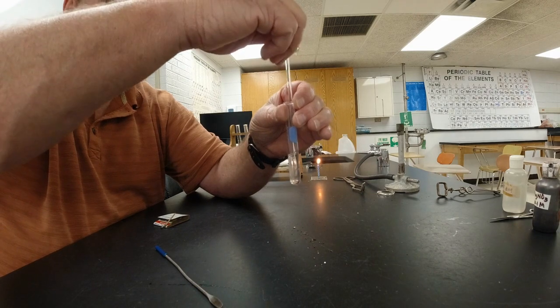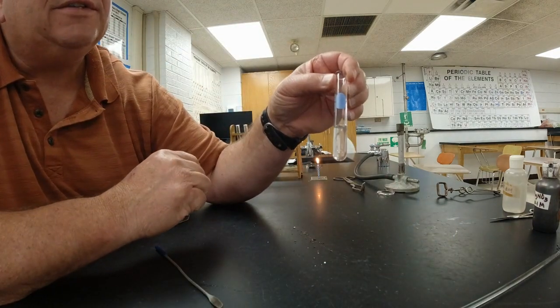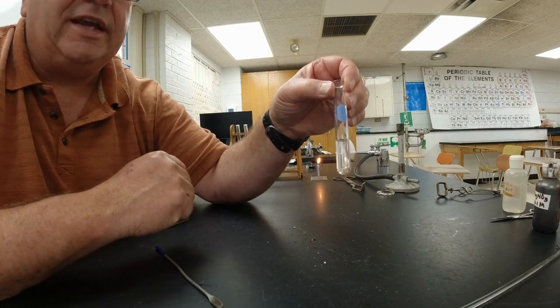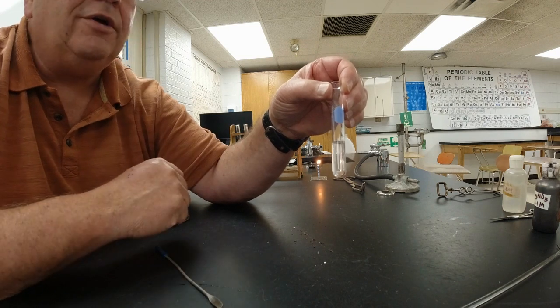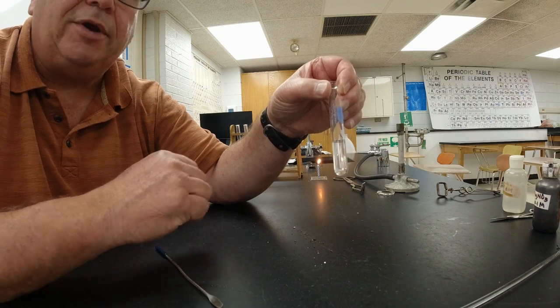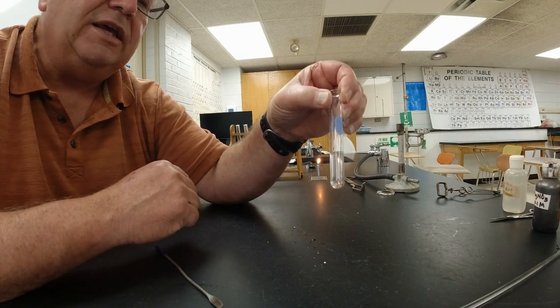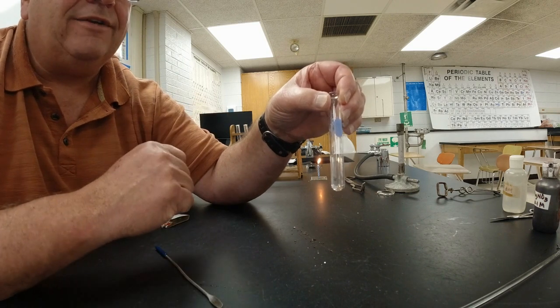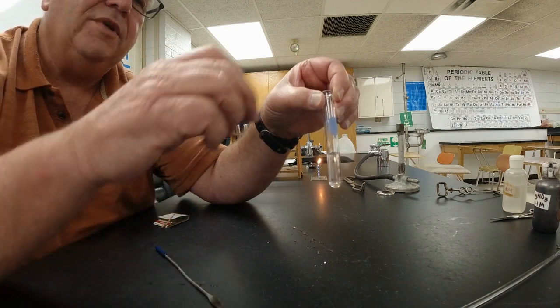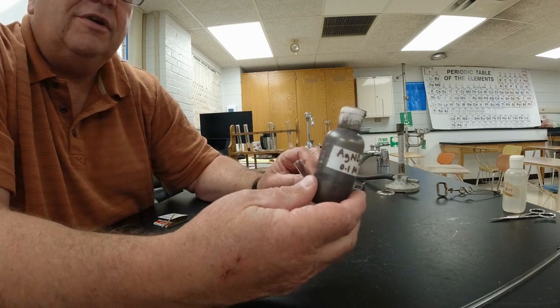And so now, if I look at the test tube, it looks as though the salt has disappeared. But it's really in there still, because if you were to taste it, it would taste salty. So you know there's still salt in there because you could taste the salt. But it seems to have disappeared. What it has done is dissolved and spread out evenly throughout the test tube. Now, how could I tell if I was looking at this if that was salt water or if that was still distilled water? Well, what I'm going to do is add something called silver nitrate.